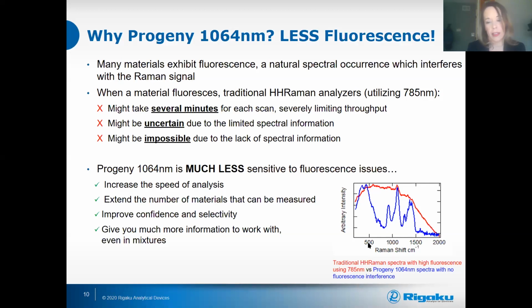Now, it doesn't always look like that. Lots of 785 instruments provide lots of great data. But the thing is, and I can tell you from firsthand experience because I worked with some of those instruments for many, many years, even when you get really great spectral data with a 785 instrument and you don't see a big hump of fluorescence like that, you still feel the fluorescence. The fluorescence is still present in the spectral data. It still must be processed through, and it still slows down the time of analysis. So scans might be limited, their scan time. You may not get all the information that you need. And some of those materials that you work with, it just might be absolutely impossible to get any information from.